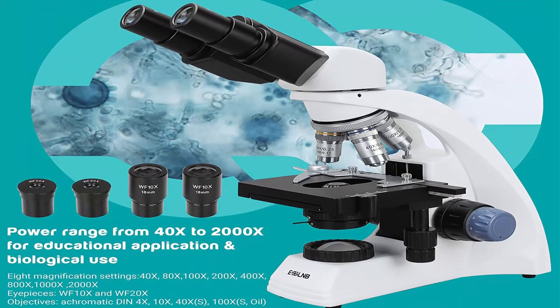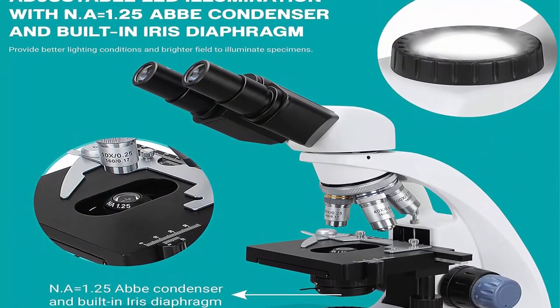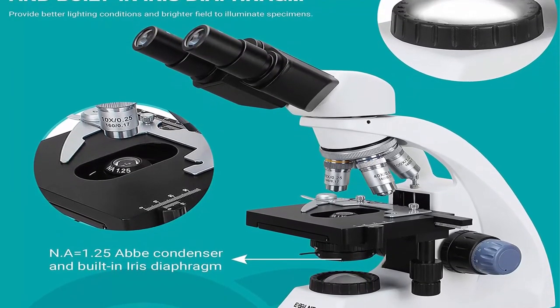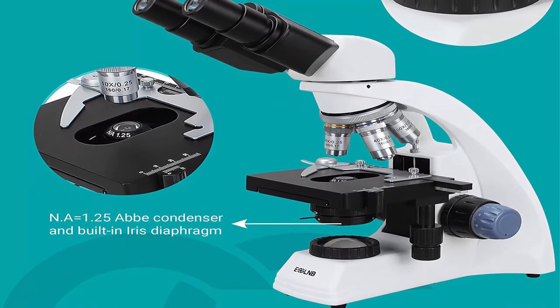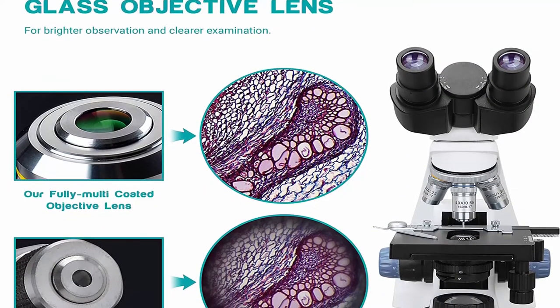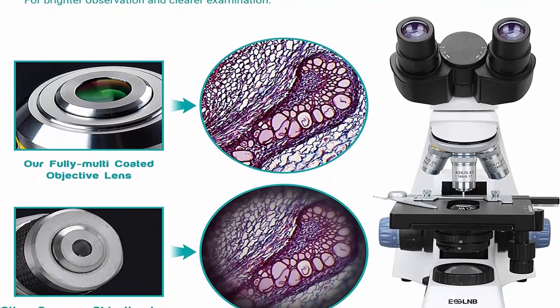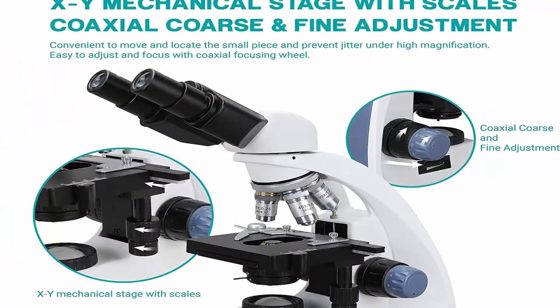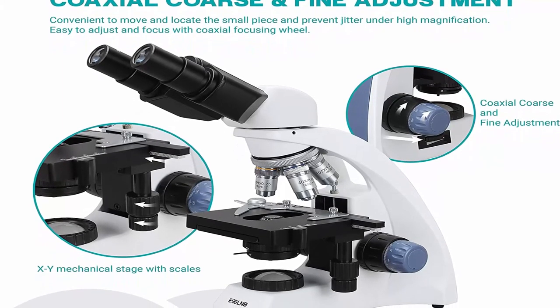55–75mm adjustable pupil distance with 30-degree inclination and 360-degree rotation provides a more comfortable and comprehensive view. Double-layer mechanical stage with scale and adjustable handle includes full graduated XY movement, allowing coordinates to be recorded so the viewer can return to a specific location on the slide. Convenient to move and locate small pieces and prevent jitter under high magnification. Ultra-precise coaxial coarse and fine focus buttons on both sides for sharp images.